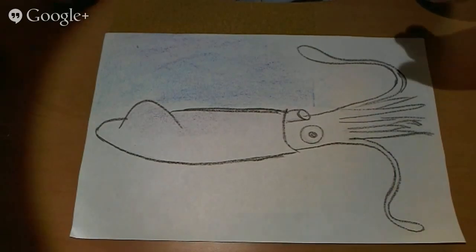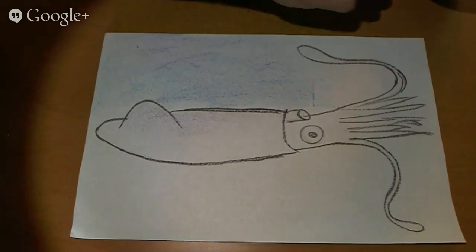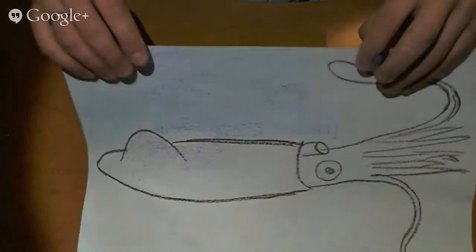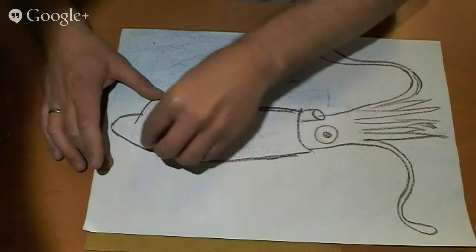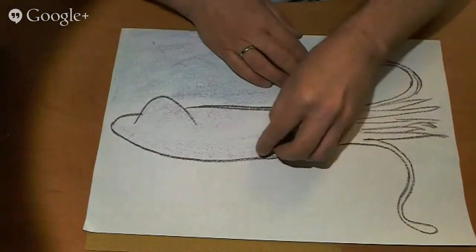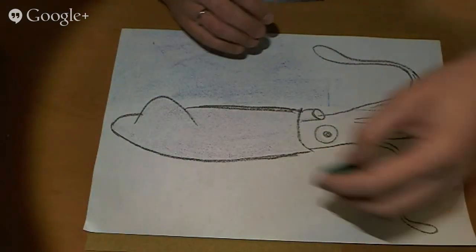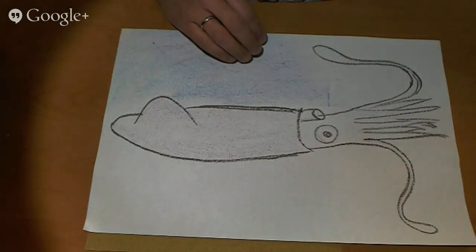I still believe that it's important for kids to actually use the scissors to cut through the different pieces to recognize things, because every time that I do this experiment, I always get something new from kids, no matter what. They're fantastic at finding observations that my brain just doesn't see anymore, and correlations as well. And even doing this, venturing out and making a live webcast or doing a video like this, I'm meeting people and learning things that I've never known before about art, about science.